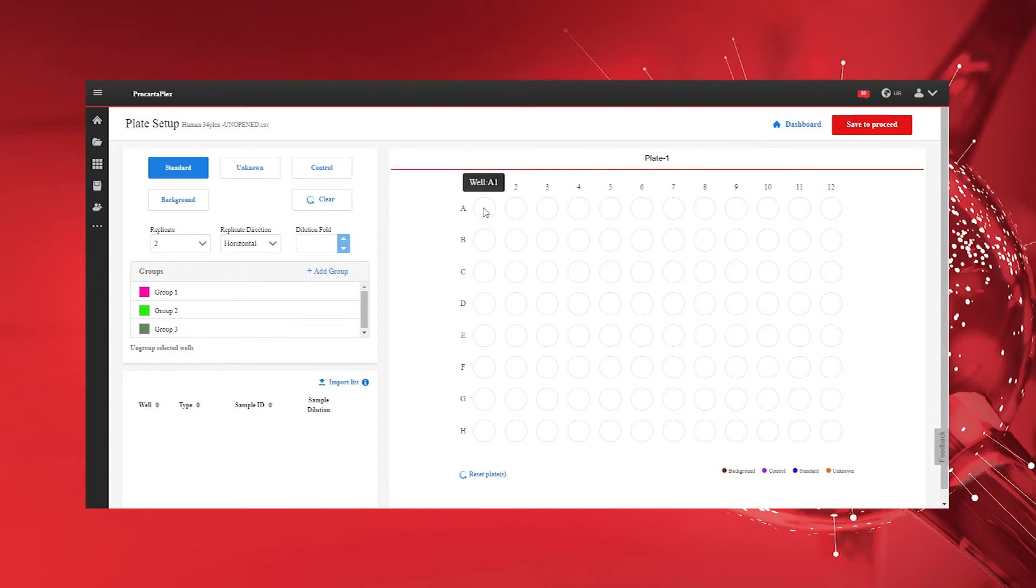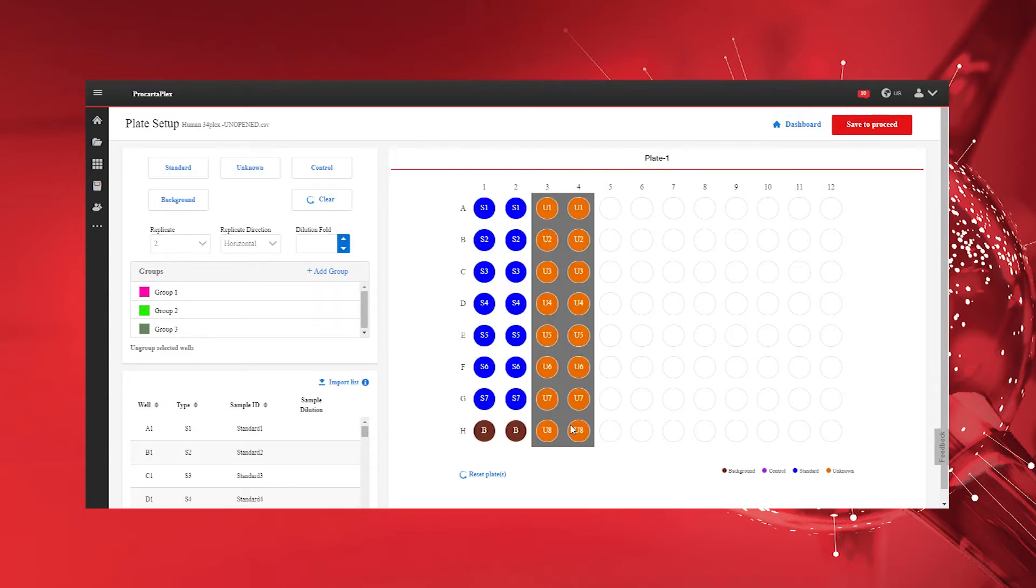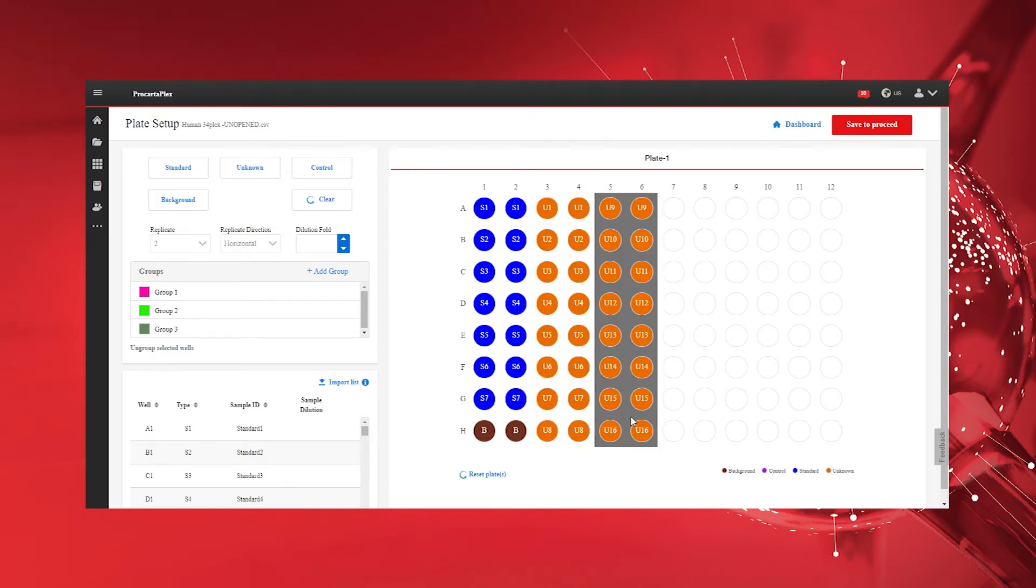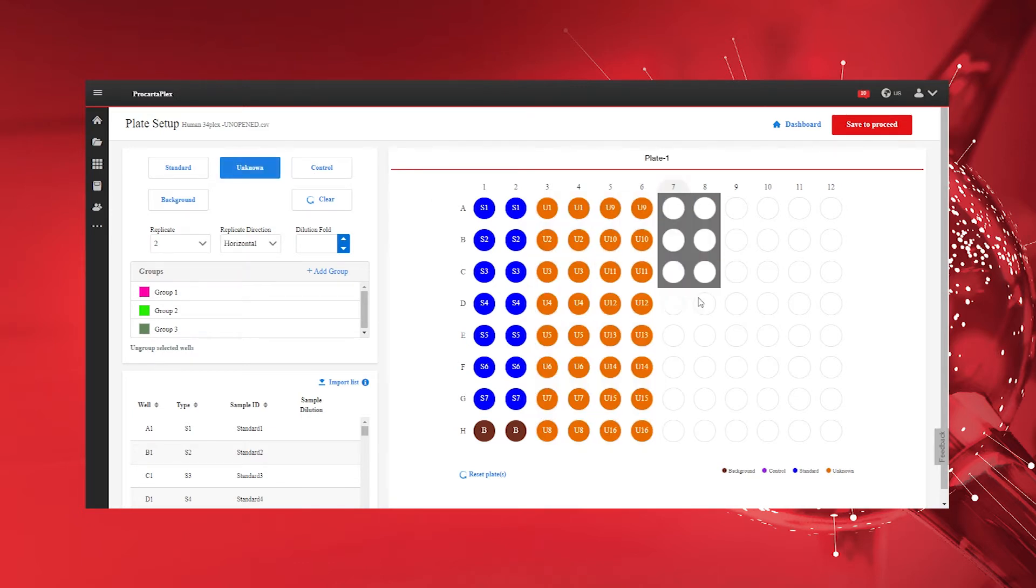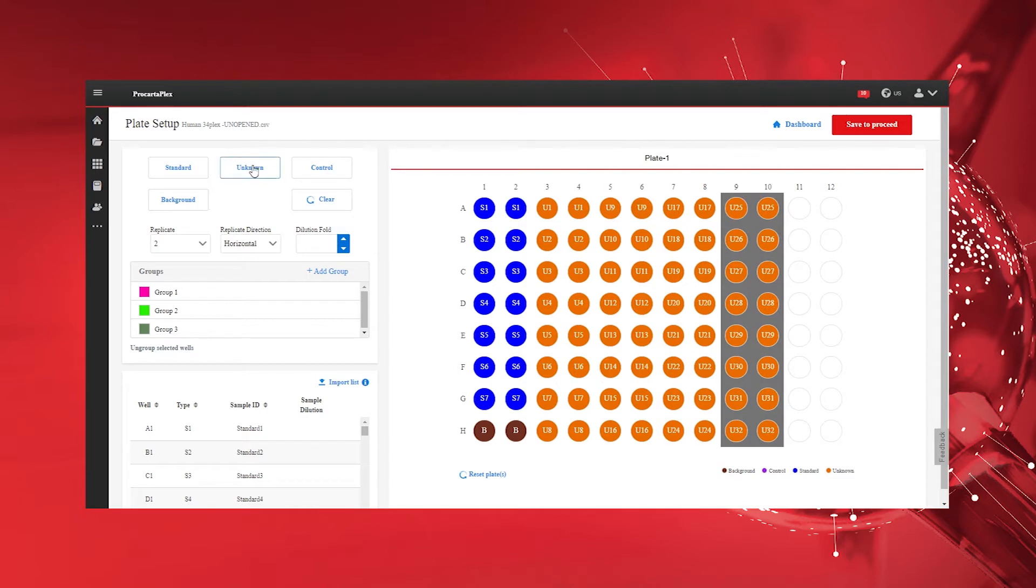If necessary, select standards, backgrounds, unknowns, and control wells according to the plate layout defined when pipetting the assay.